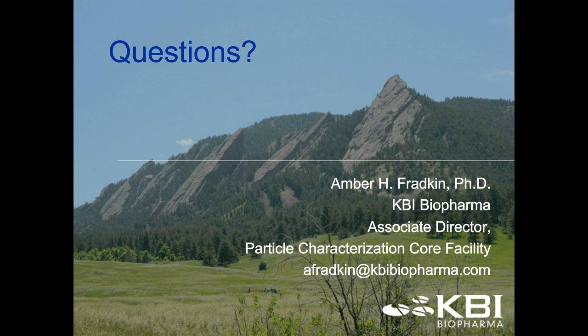As I mentioned, MFI is not very robust at classifying particles less than, say, 6 micron. So I generally recommend, if we do see an abundant population of particles in that size range, something like the Archimedes to help understand what those particles are. Certainly the morphology can go down to about 3 to 5 micron, a little lower if it's a small molecule, but it's not as high throughput as the two techniques I mentioned, the Archimedes and MFI. So we generally start with those two techniques.